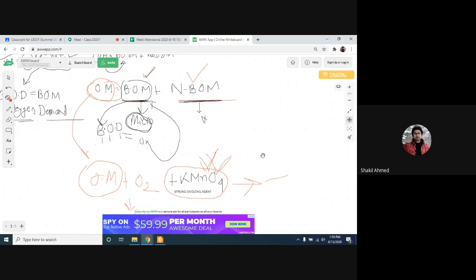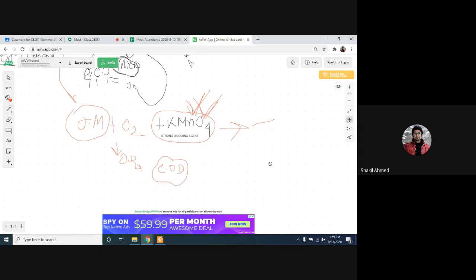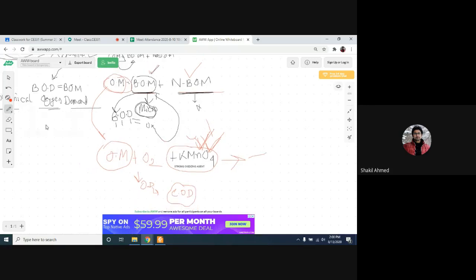Since we have used a chemical, we call it COD, chemical oxygen demand. This COD is basically the total organic matter.